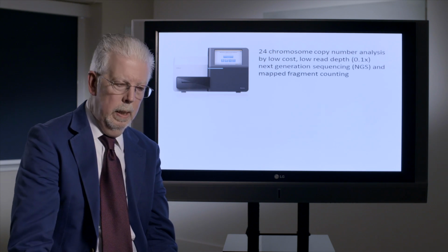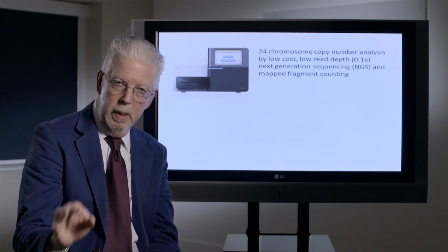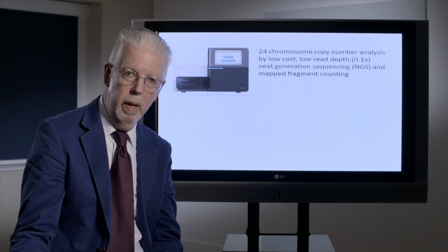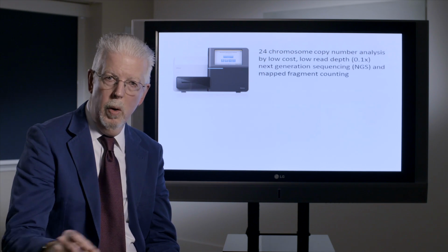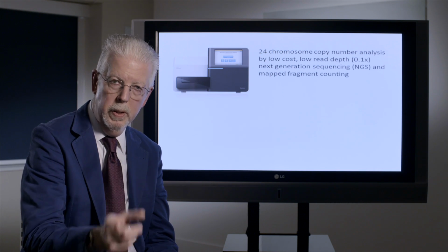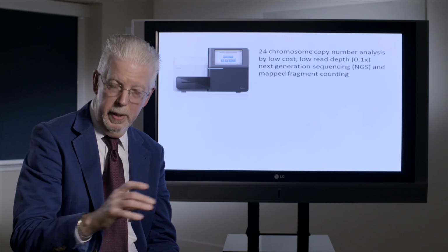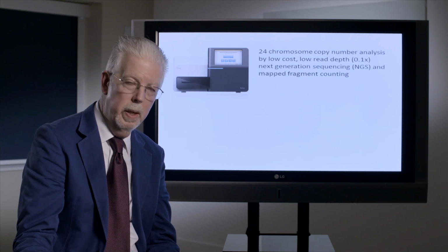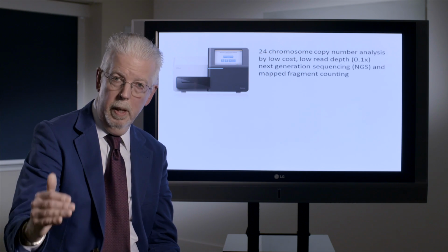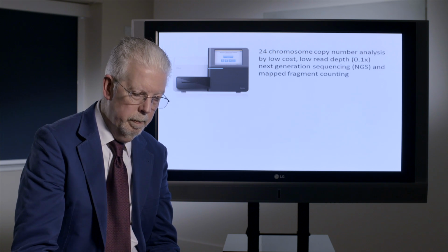So in this case, what we're doing is not trying to sequence the whole genome of the embryo, but simply to randomly amplify short sequences from throughout the genome of the embryo and map those back onto the different chromosomes, and then go back and count how many. Because this process is essentially random, if you select the right regions of the genome, and that's where all the work comes in, of course, in developing these tests, we can get a very good readout of the copy number of the target chromosomes that were originally present.